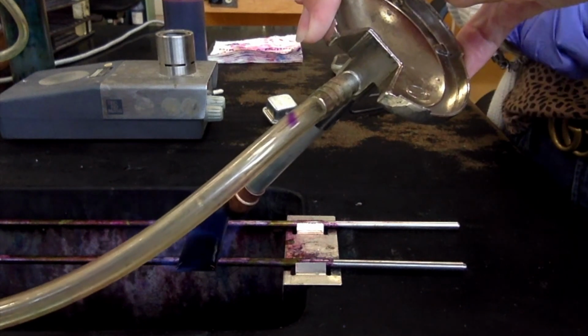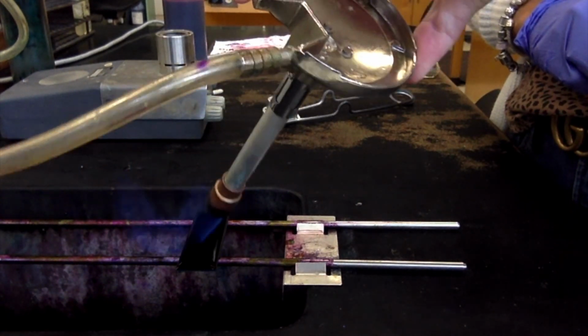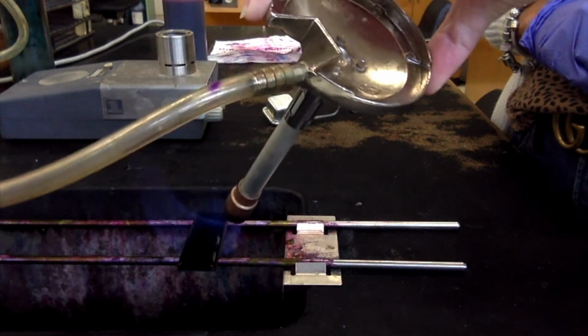And it might spark a little bit, but that's okay. And I'm going to flame the stain. Now you'll notice that I'm putting the flame directly on the stain. That is what I want, okay? I want this stain to steam.